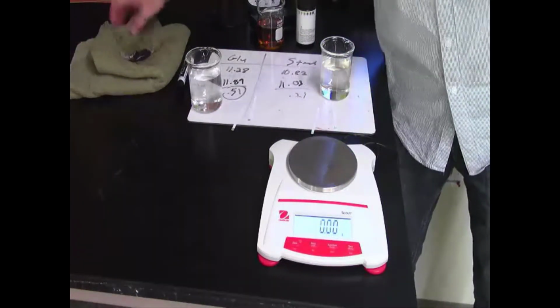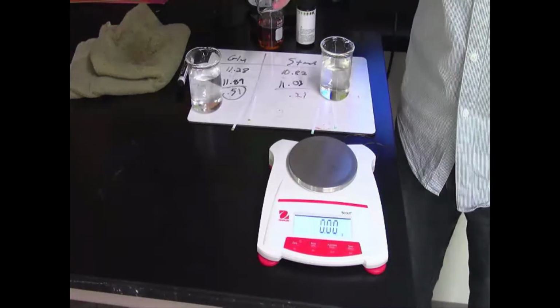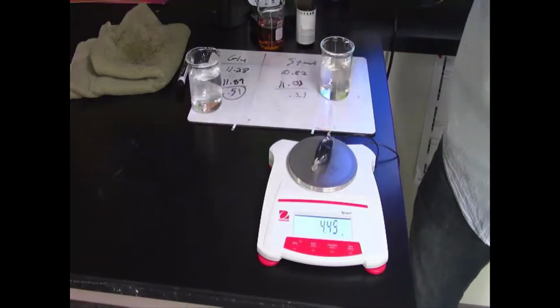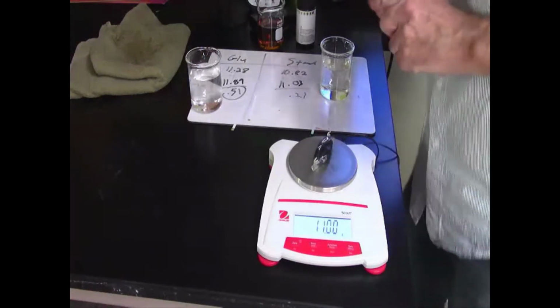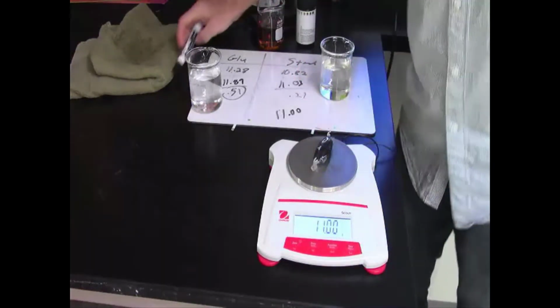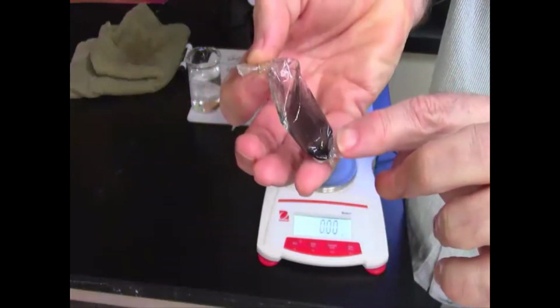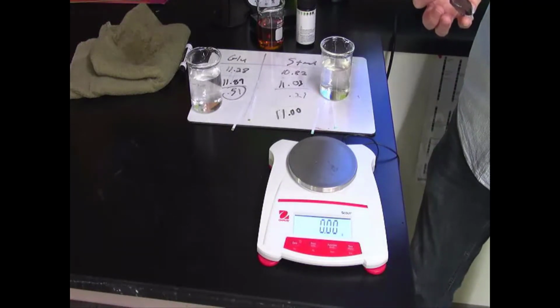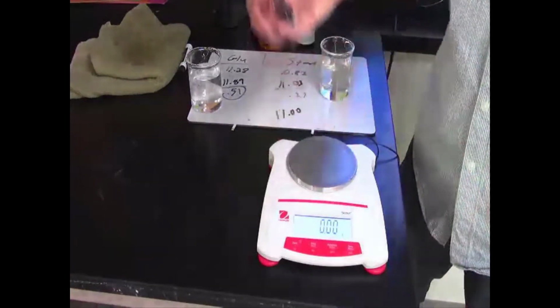The next thing is, let's see what happened to the weight. So it started at 10.82, went up to 11.03, evidently water was leaking into the bag. I presume it's going to be more than 11.03. Let's see. Oops. It's 11.00. So it weighed a little bit less, which is curious. I think what might be happening is, if you look right here, there are indications that this is leaking. Gosh, that's unfortunate. That's odd. It should have weighed a little bit more because the starch in here should be bringing water into it.